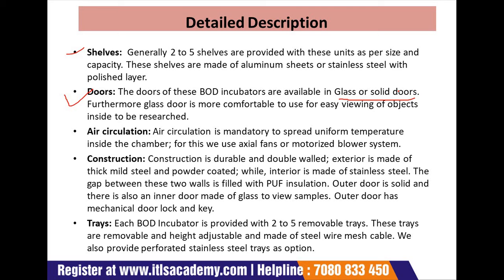Furthermore, a glass door is more comfortable to use for easy viewing of the objects inside without opening. So, next is the air circulation. Air circulation is mandatory to spread uniform temperature inside the chamber. For this, we use an axial fan or motorized blower system.